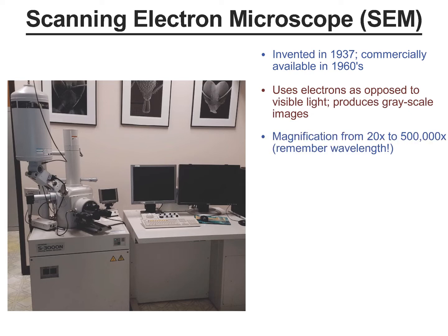And because of the short wavelengths of electrons, that means we can achieve much higher magnifications and far greater resolutions of microscopic objects.